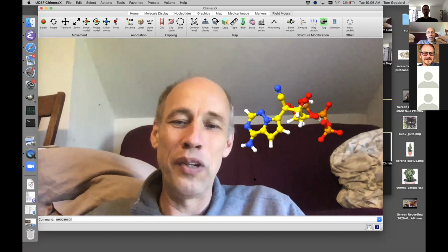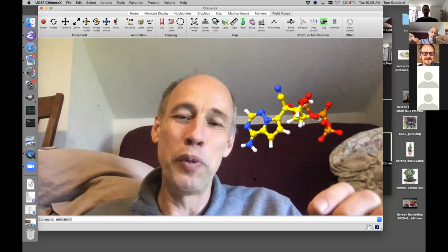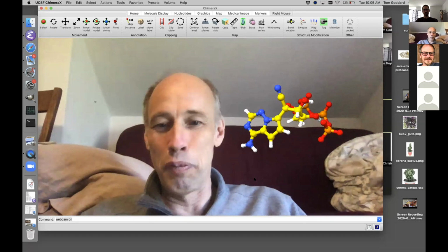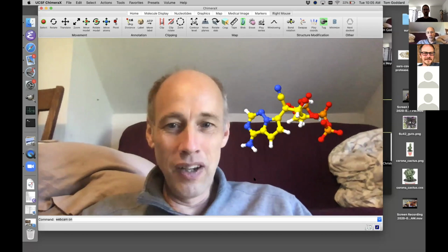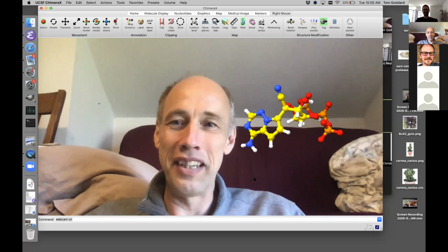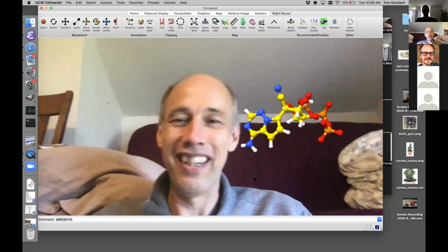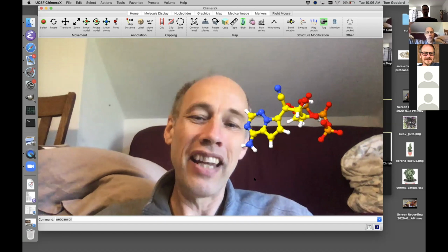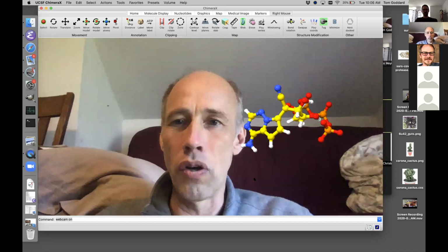So what I just told you was, it doesn't exist in ChimeraX yet, but in a couple weeks, probably more like a few weeks, it might exist, because the person sent me the looking glass device, hoping that I would be tempted to make ChimeraX work with it. And that's probably going to succeed. Like, I will be tempted. But again, that's a $600 display for just a little 9-inch display. The 15-inch one is like $3,000. And so it's sort of out of reach for most people to get.